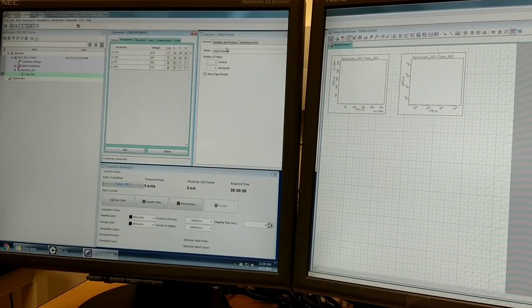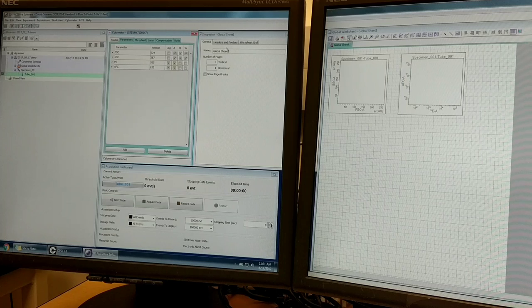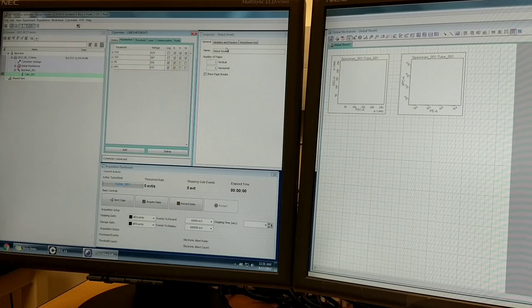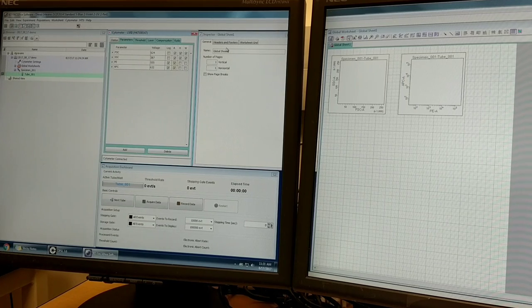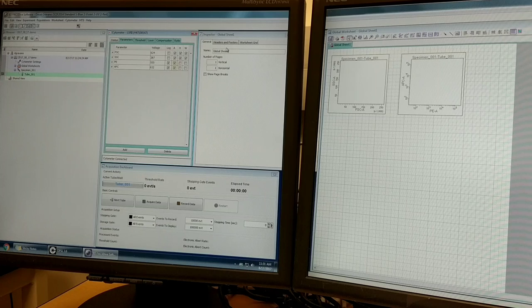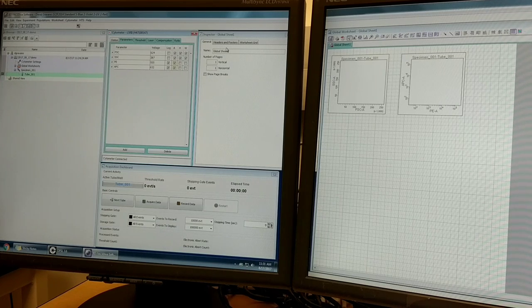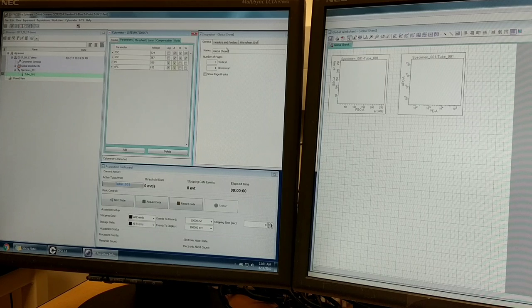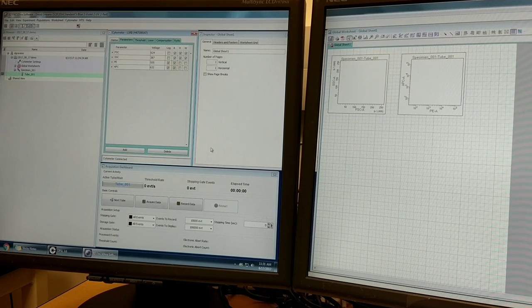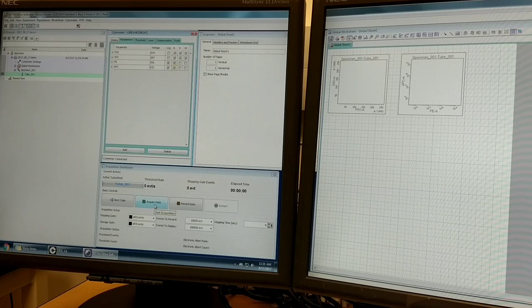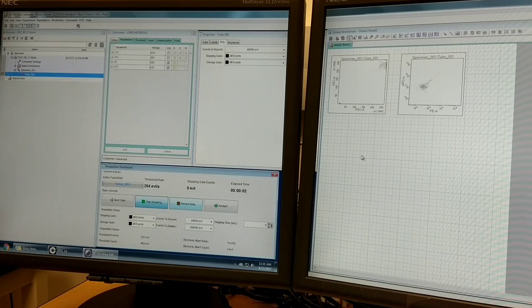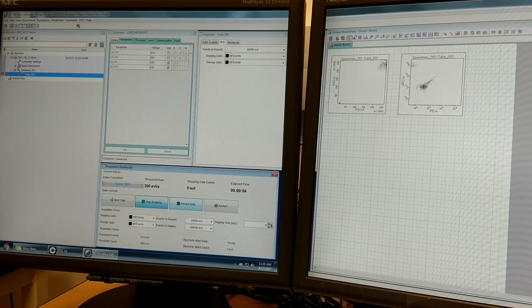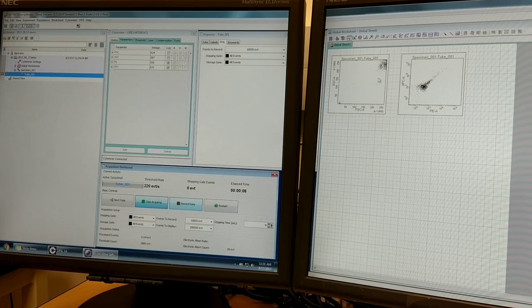Now I'm going to start with my unstained tube to pick out my forward and side scatter voltages that put my beads on scale, or your cells if you're running cells through. So I'm loading my sample and I'm going to press the acquire data button in the acquisition dashboard.